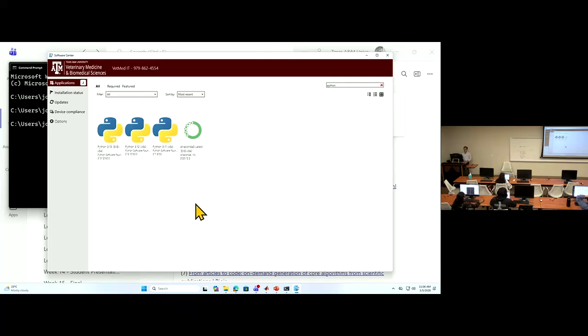Okay, I have several options. We have 3.12, 3.11, 3.13. I don't know on your machine, so you have your own control of your Mac, your laptop. That's good.